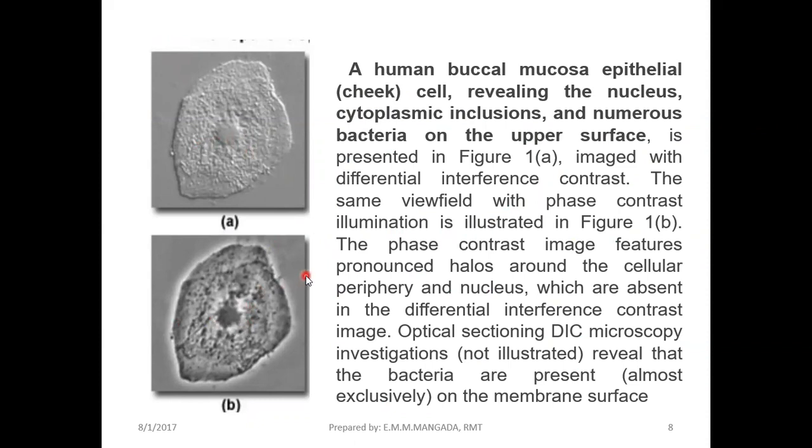So it depends on what we used. Under your DIC, or differential interference contrast microscope, this is it, guys. Do you remember that earlier, it was said your DIC is very helpful, especially when viewing or assessing surface properties. So this is actually the cell. If you can see this cell here, viewed under your DIC, it seems like it's something that is embossed.